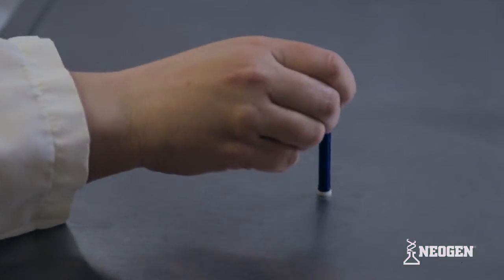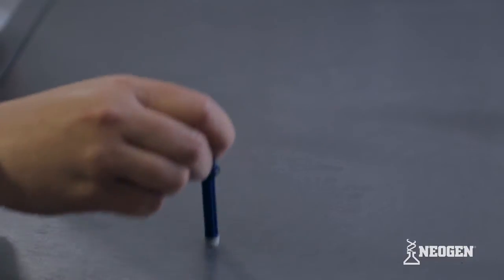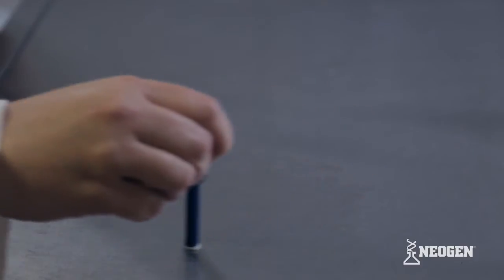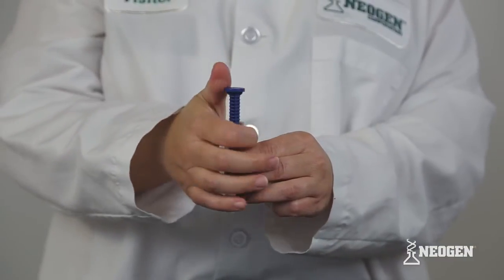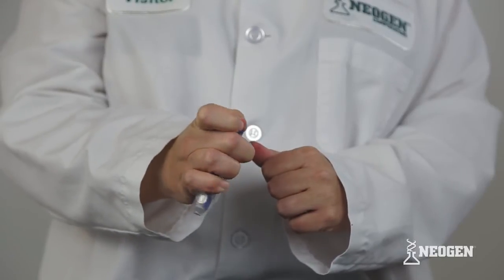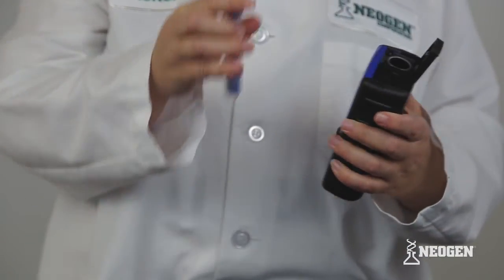When using the new AccuPoint Advanced Samplers, collect the sample from a 4 inch by 4 inch area or rinse water. To activate the sampler, gently mix for two seconds while keeping it vertical, and then immediately place it into the AccuPoint Advanced reader.